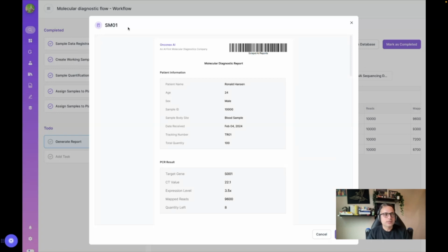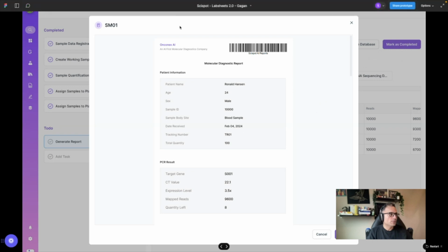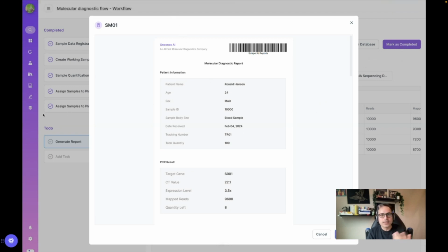Okay, great. So I think that was a high-level overview of the whole workflow in the slide that I just showed. But any questions would be great.